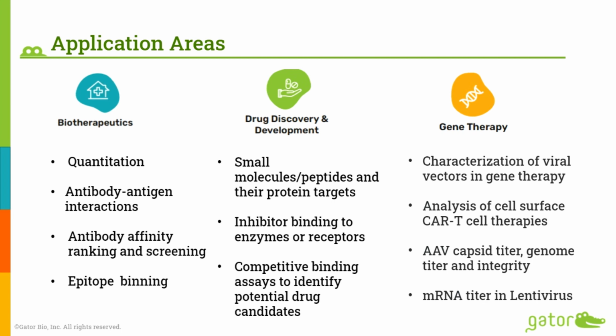And he has thousands of them, where he wants to characterize these nanobodies that he has expressed, whether they show any binding towards any of the antigens or not. And if they bind, can we rank or screen this periplasmic solution based on how strongly they bind towards the target antigen?